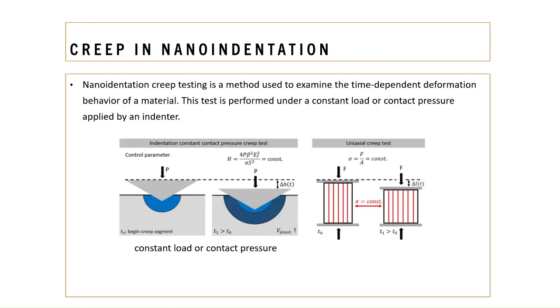Then nanoindentation creep testing is a method used to examine the time-dependent deformation behavior of a material. This test is performed under a constant load or contact pressure by an indenter.